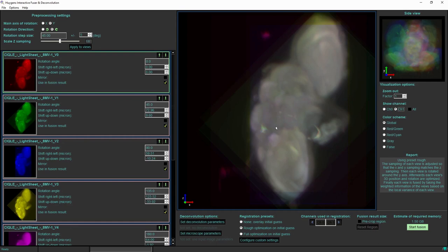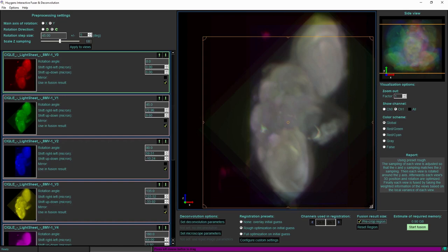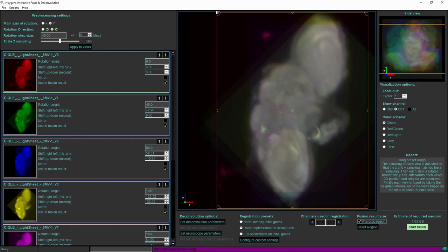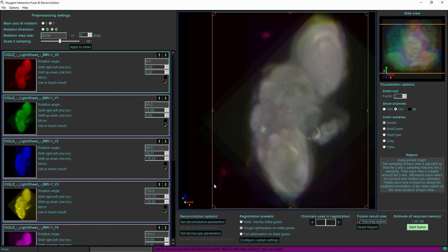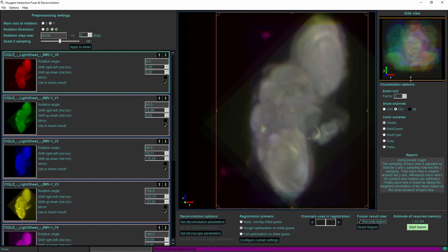Now I can start the automatic process, but first I can select which region in 3D I would like to have included in the resulting image. If I know that the dataset is from the right side up to here, I can with the cropping box restrict the region that will be included in the result, and that will be taken into account also in optimizing the relative positions.